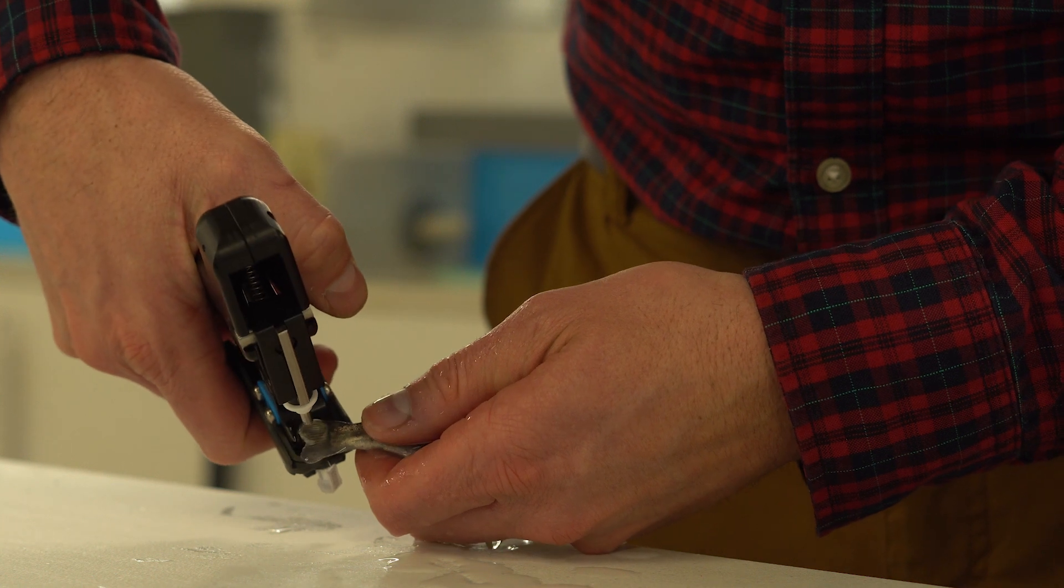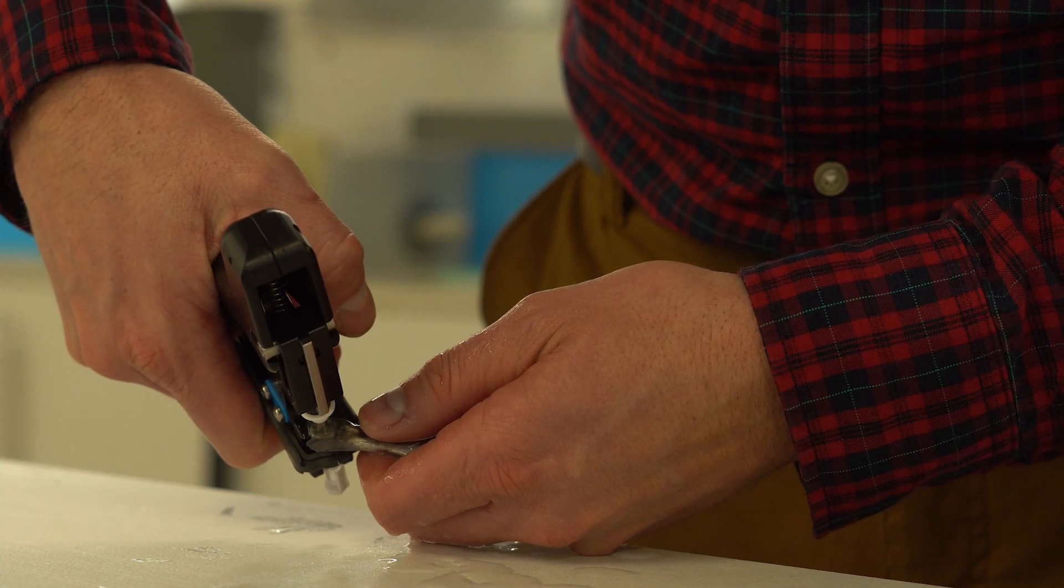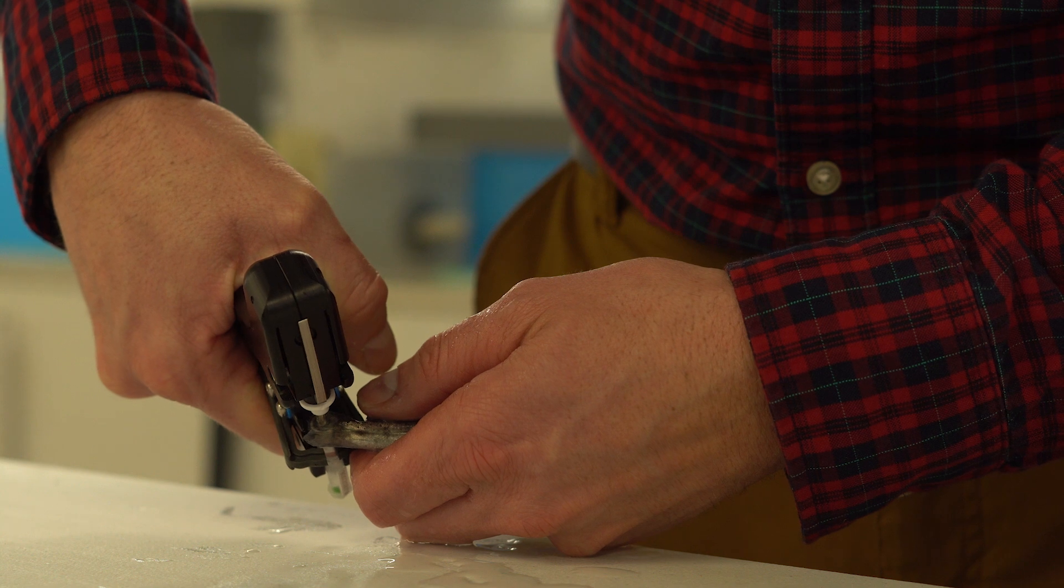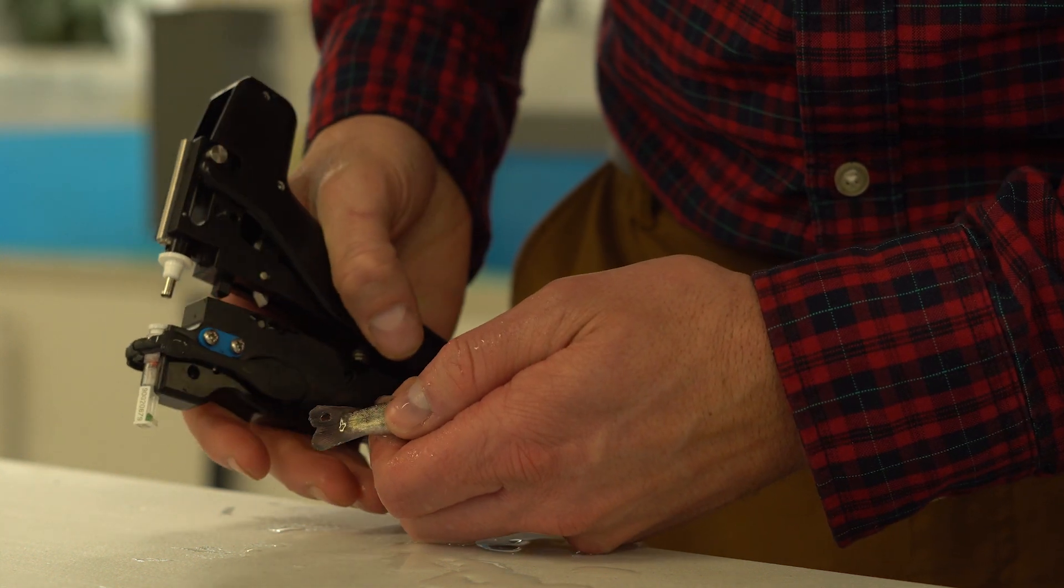Here's an example of a tail clip being taken on a smaller juvenile fish. A clean 3 millimeter diameter section should be visible when a proper sample is taken.